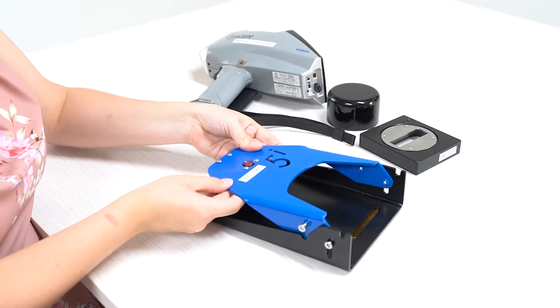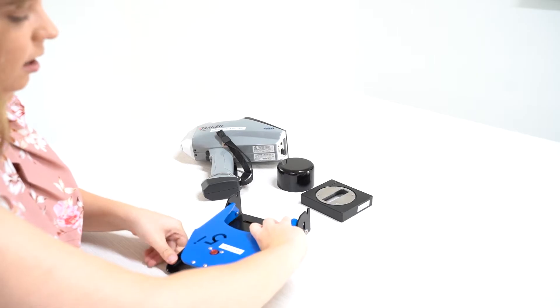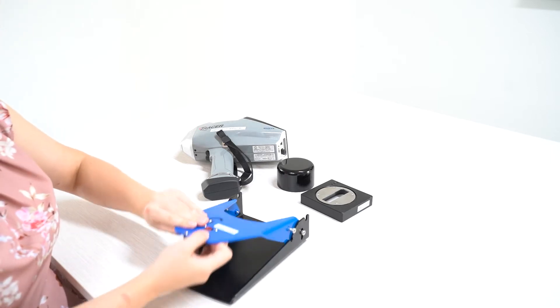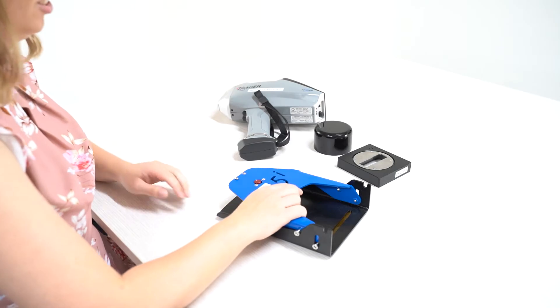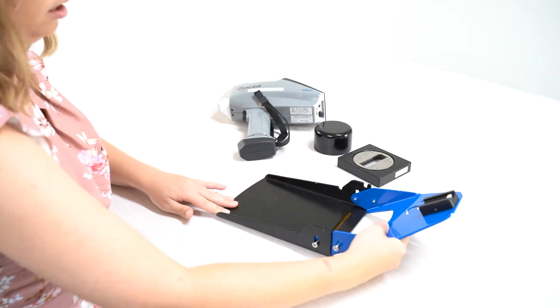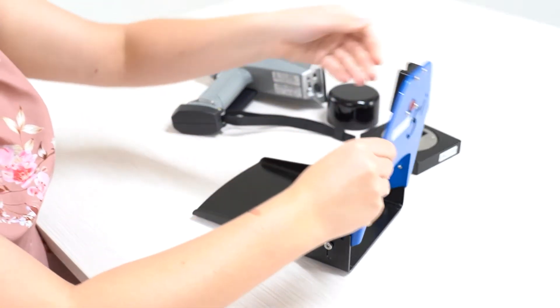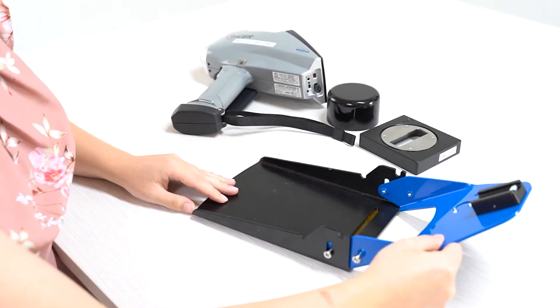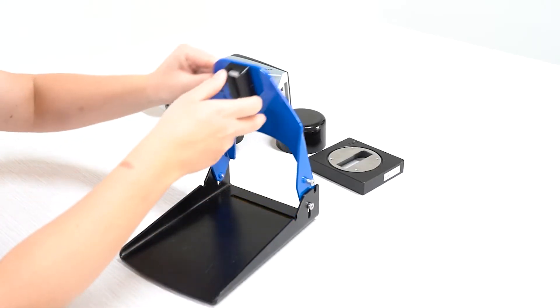There are two main positions. One is at 45 degrees to help with placing the tracer onto the rail, and one is at 90 degrees for analysis. To put the stand into these positions, you want to grab the blue part of the stand. It is an up and over movement. For the 45 degree angle, you want to keep going over until you can't anymore. For the 90 degrees, you want to go up and place it into the little divots at the top.